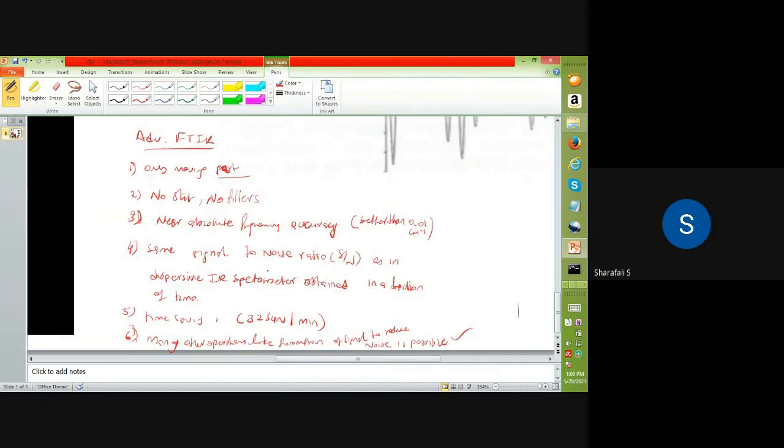So this is possible in an FTIR spectrometer if you are using it, because we have that system, and the system also allows you, you can write it as the 7th advantage, to remove the background spectra or anything else, like what we discussed for the case of solvents. If you are using a solution, then we can remove that solvent spectra from the sample spectra. If your sample is a solute, that kind of addition and subtraction of spectra is possible in an FTIR spectrometer.